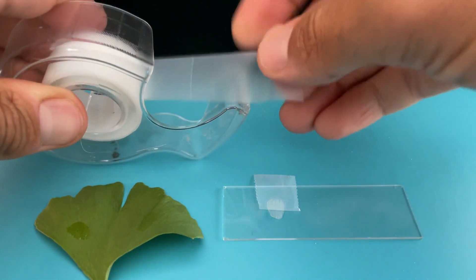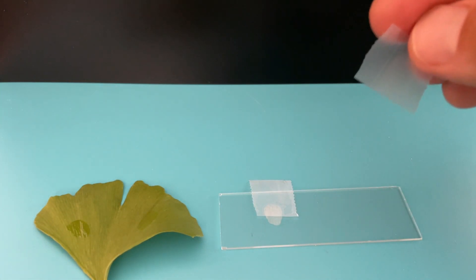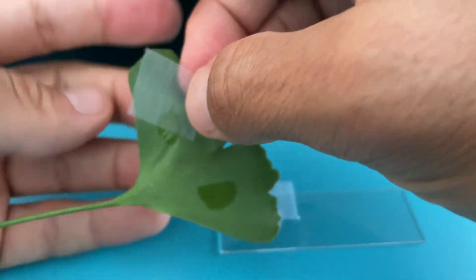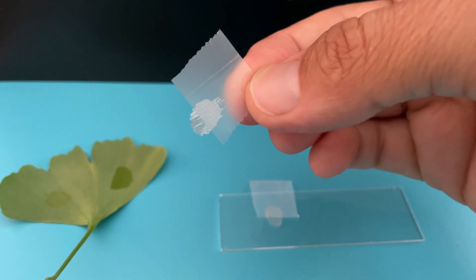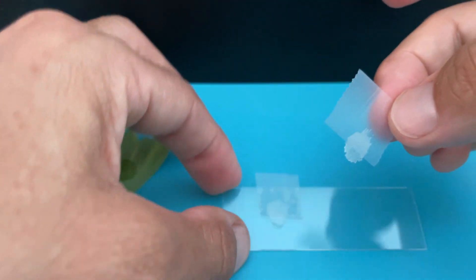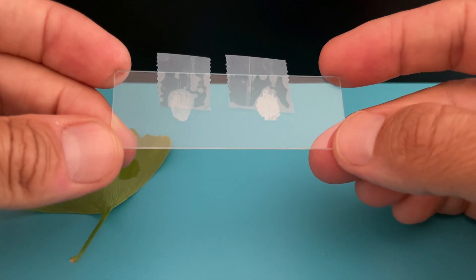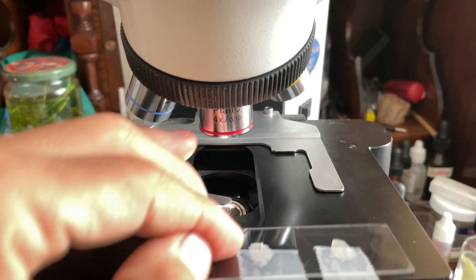Now I am going to repeat the same process for the other side of the leaf. I have my slide ready with the imprints of the leaf, so now I am going to look at it under the microscope.